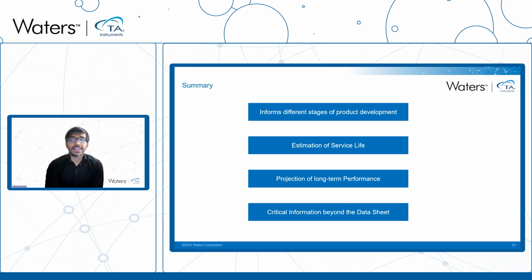I'd also highlight that a researcher or manufacturer can project the long-term performance utilizing these methods. For example, TTS allows a user to project the evolution of material response for very long duration, such as several to 100 years, which may not be possible to be evaluated by a manufacturer with the other available methods.